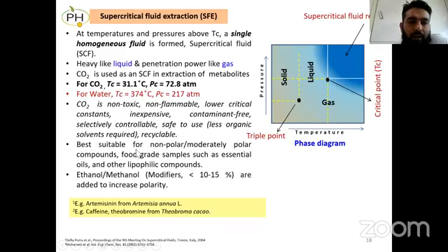And also carbon dioxide is recyclable, so you can recycle the solvent after the extraction also. This method is widely used for non-polar or essential oils or food grade samples, or lipophilic compounds which are not solubilized in polar solvents. So you can also extract with the help of carbon dioxide.